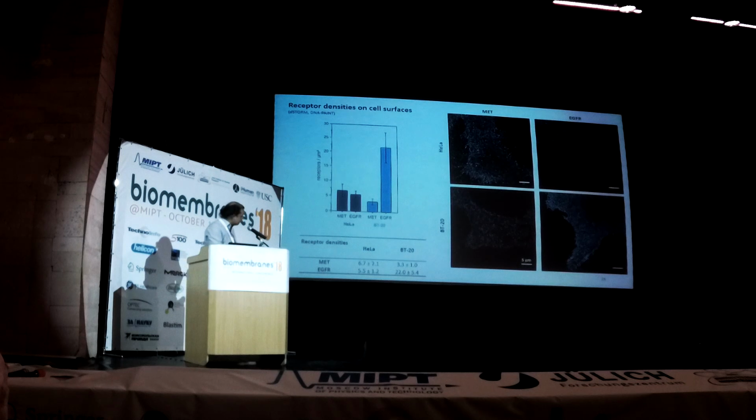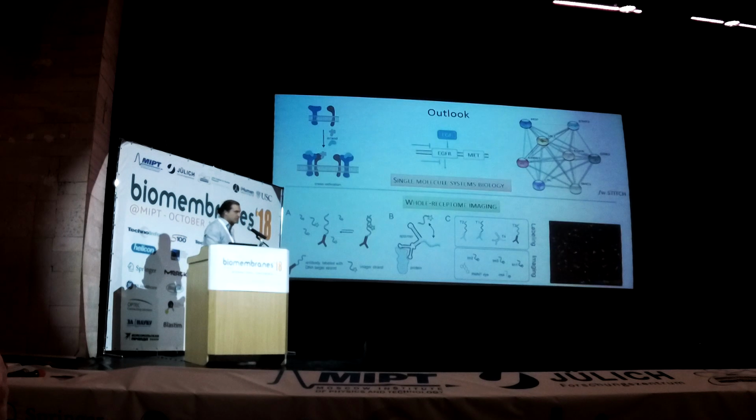So that's about it. I have the clinical paper, which I stopped because I would like to talk a minute about that, otherwise this will get too late. Let me just summarize what I've shown you. There's receptor imaging. We can do 2 or 3 receptors. We'd like to do many, many more. This has some technical requirements, which we are close to meet with new single molecule imaging technologies.